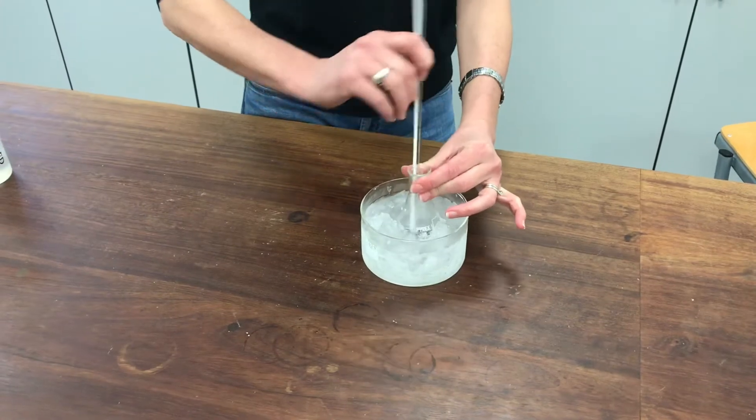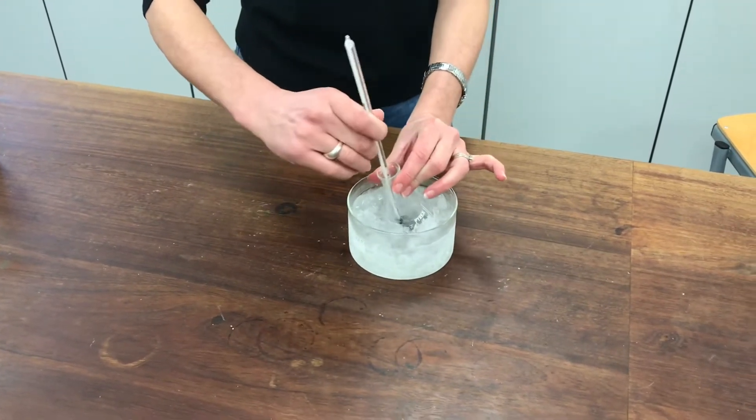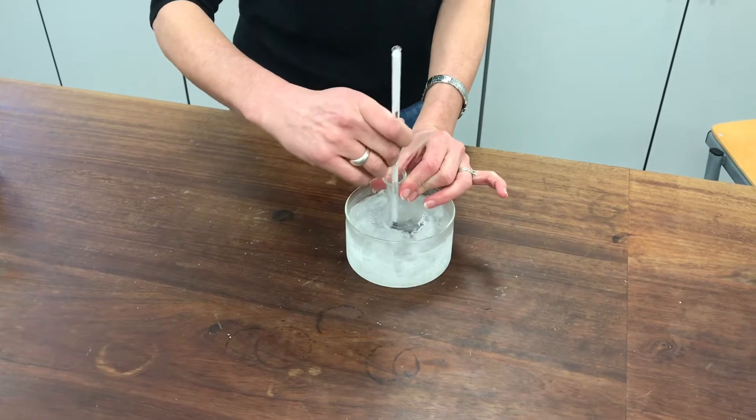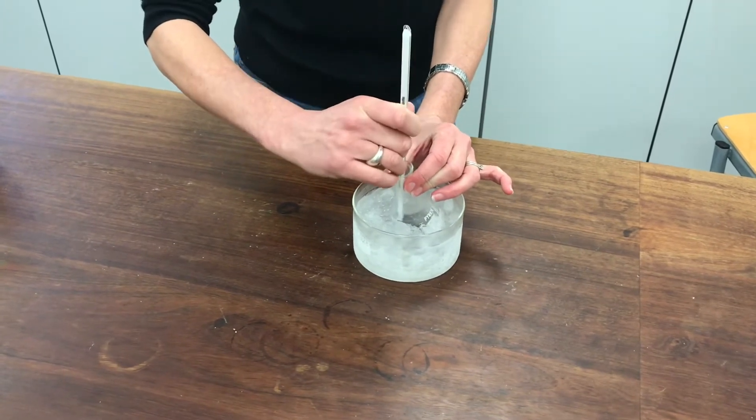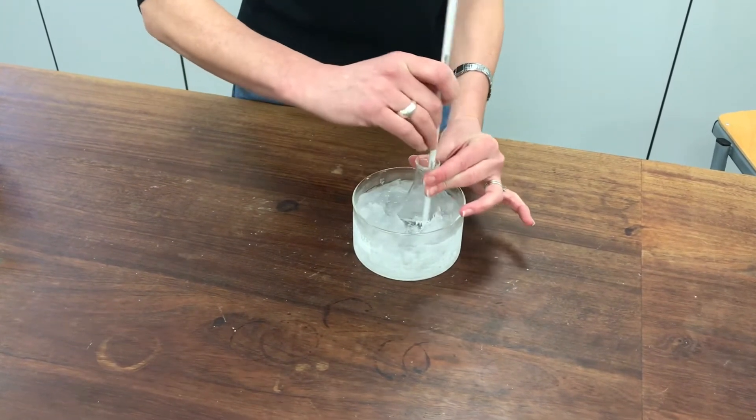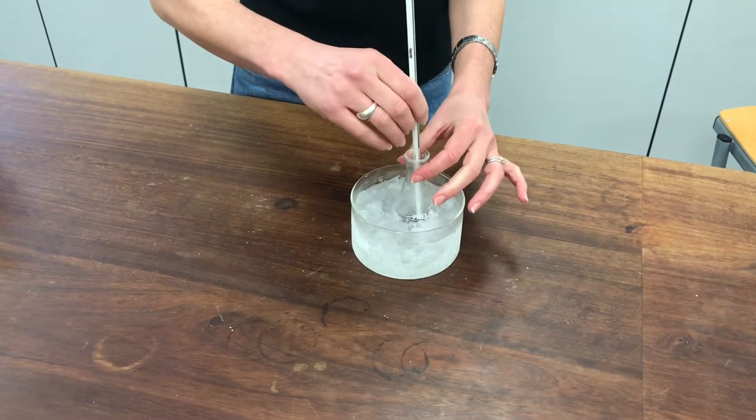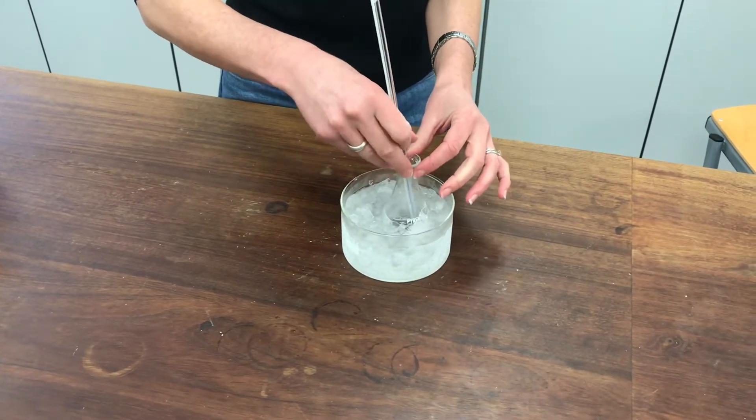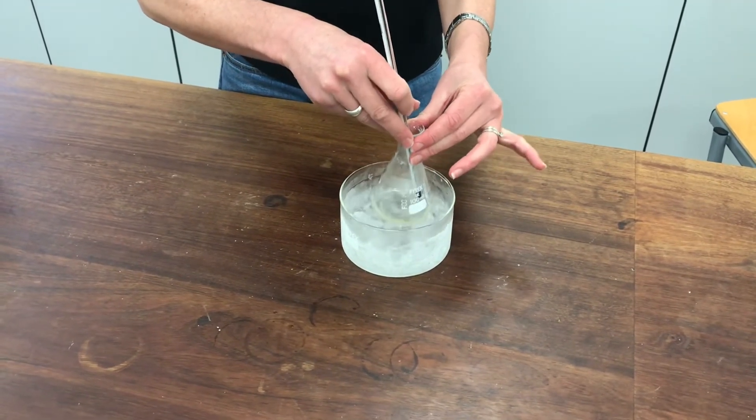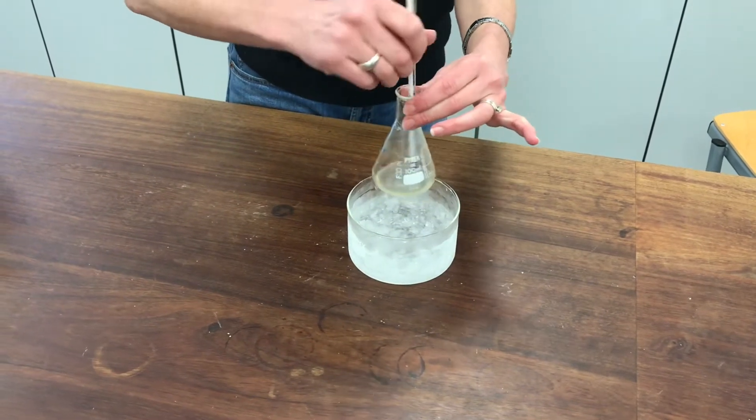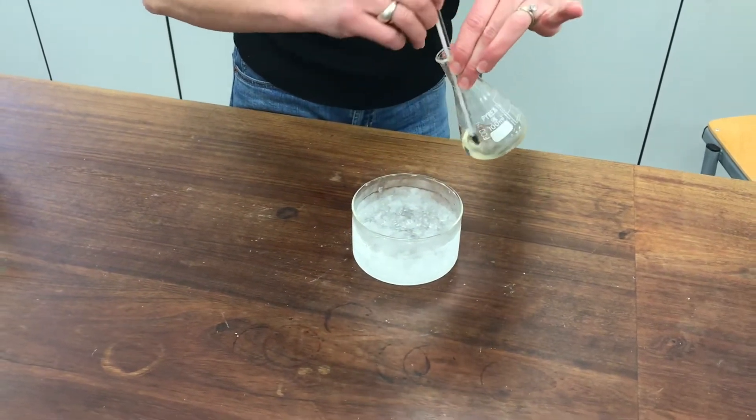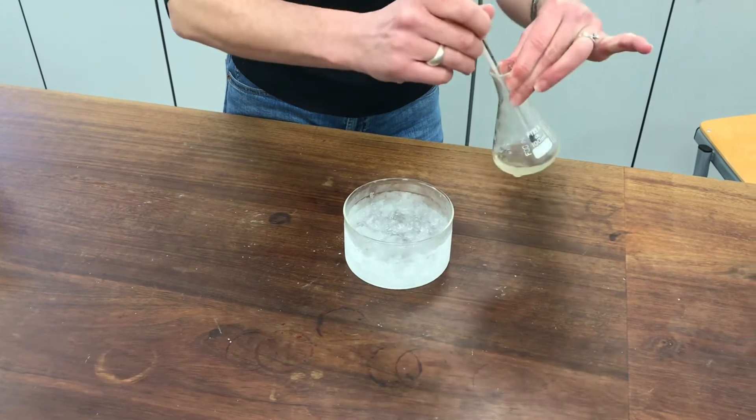OK, I've finally added all the nitrating mixture to my conical flask here. I've kept the temperature really well below 10 degrees. It's actually on about 2 degrees at the moment. It's taken almost 25 minutes to add 4 cubic centimeters of nitrating mixture to my conical flask here. And you can see the conical flask, it's quite oily and resinous looking, the stuff that's in there.